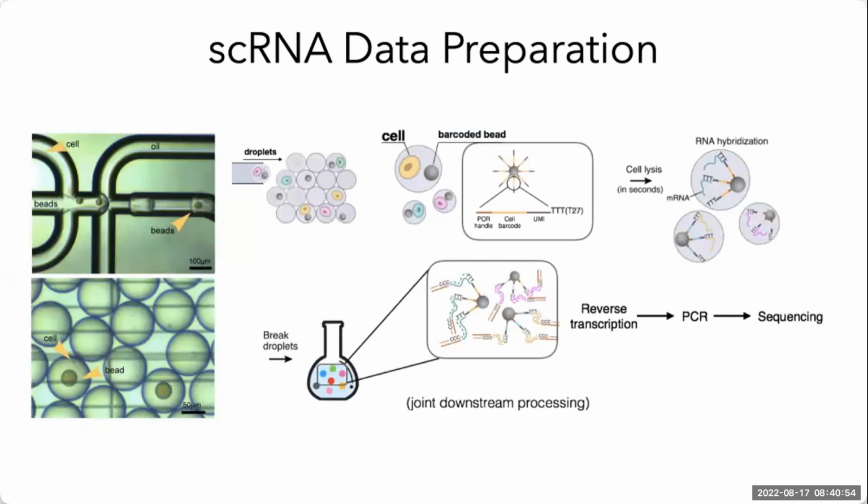On the other hand, being restricted to one end of the transcript may reduce mappability, and it might make it a little harder to distinguish between different isoforms of the genes. Generally, the strategy used for capture determines the throughput, and it also determines what kind of additional information besides sequencing can be obtained.